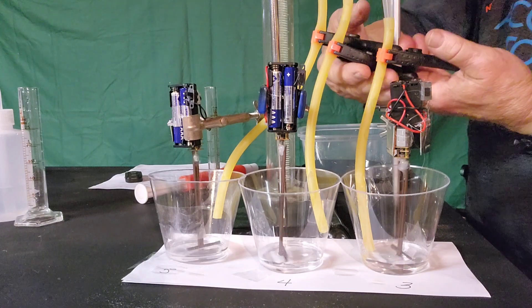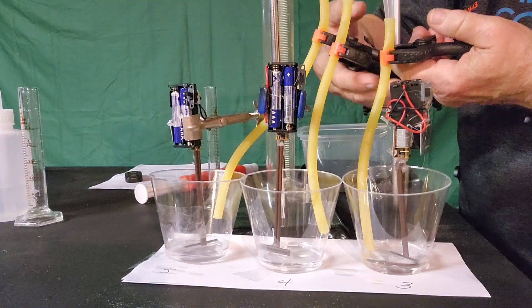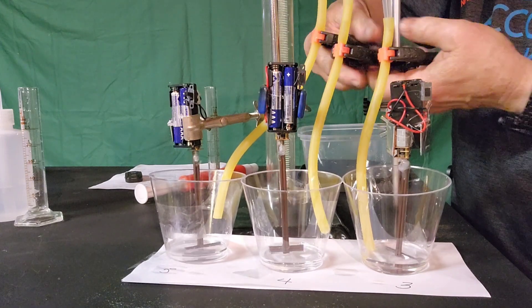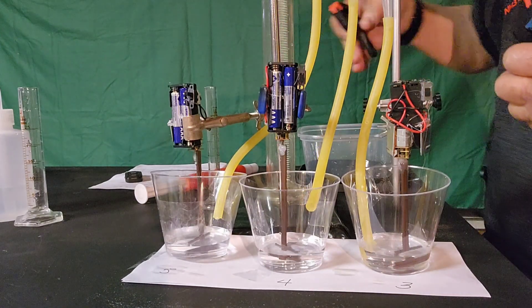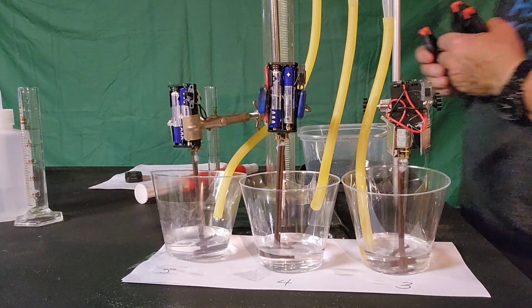And now the tricky part. I'm going to have to let loose the 20 milliliters of the other solution all at once here. So we're going to see how it works. And action. And now we wait to see what happens.